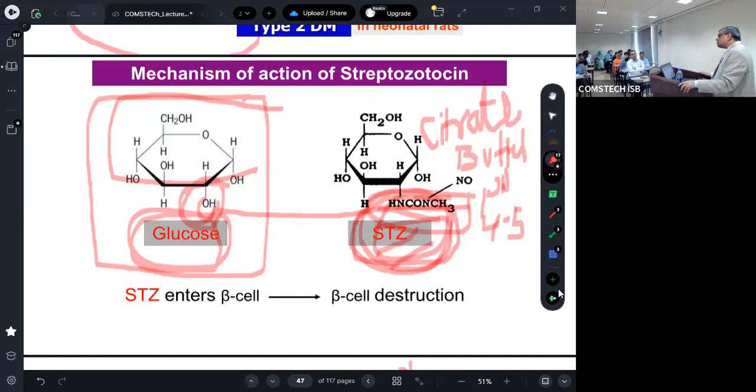Number two, streptozotocin's half-life is a few minutes, 2 or 3 minutes, I don't know exactly, but very short. Then my question is how you can manage. Normally, many people know how to do it. So your lab is here, your animal house is far from your lab, right? In many universities, many places, your lab is here, your animal house is maybe 10 minutes away.